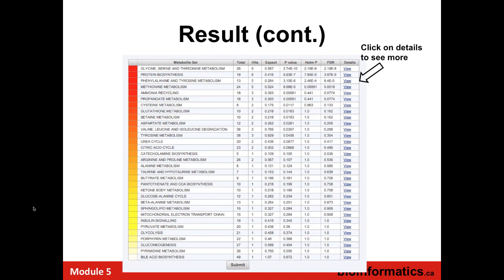Again, sometimes the database does not recognize it. So let's say I have some metabolites, like 6 metabolites. They should hit with some pathway, but there are only 2 IDs recognized. So 4 are not counted. In that case, they are showing the FDR value is 0.12 or something. But I know they already did not recognize another 4. If those 4 were included, the FDR value could be around 0.005. So what can I put and how can I argue these things in a paper?